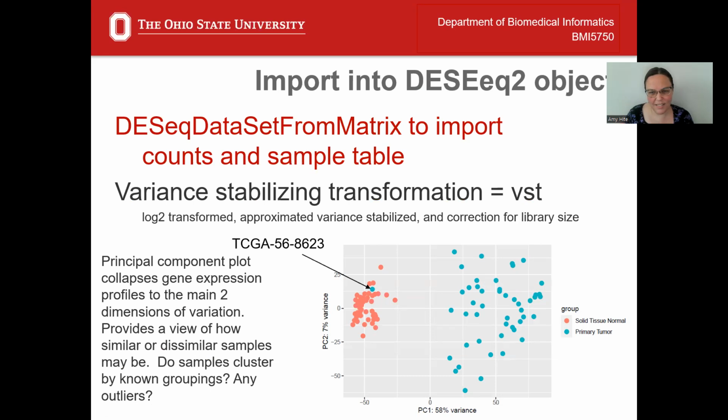And in this example, I notice there is a blue sample just hanging out with our normal tissues. So this seems like a problem for us. It's either a sample that was mislabeled, or it's a tumor sample that, when it was dissected out from the tissue, held on to a big chunk of normal, and that just got processed in. So now this particular tumor looks a lot like a normal sample.